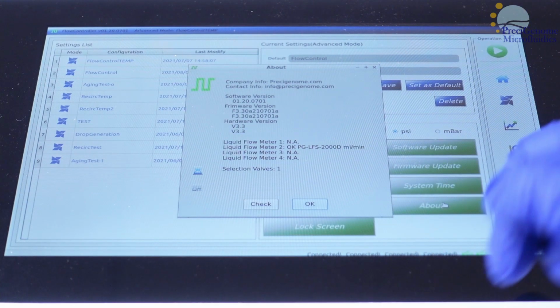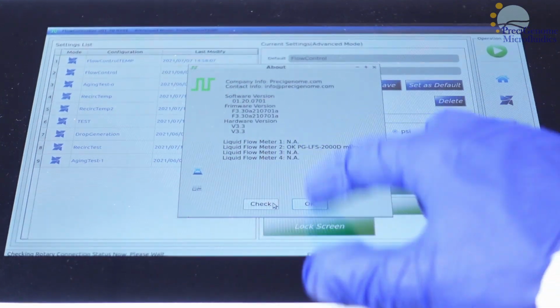For more about controlling specific components, please see their respective videos.